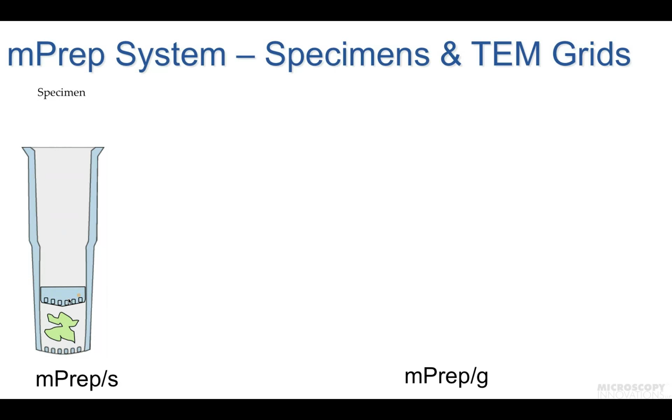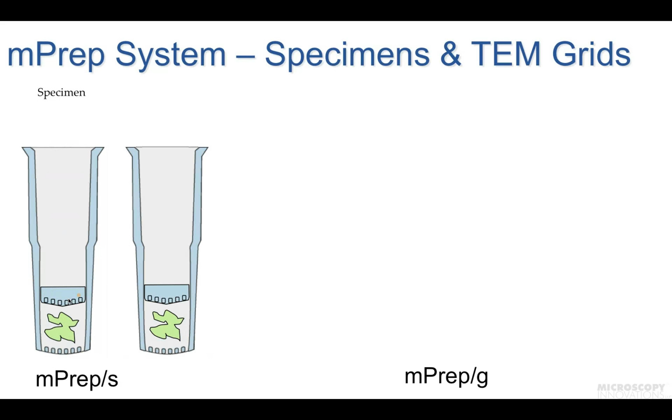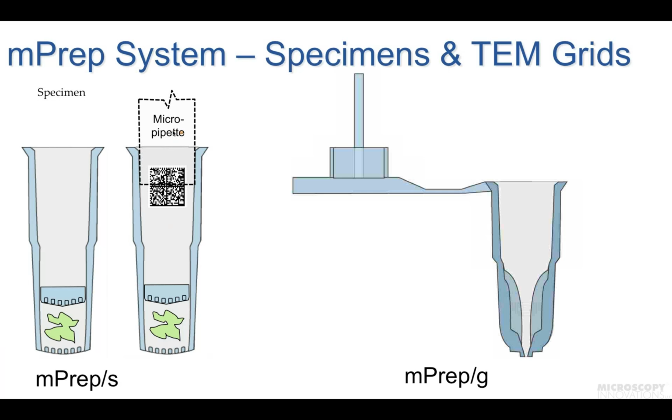Once specimens are in the capsule, they can be barcode labeled, as we see here, with a 2D barcode or an alphanumeric label. And then for fluid processing, the specimen capsules are attached to micropipettes, ordinary pipetters like a Pipetman, and the fluids can be drawn in and out.